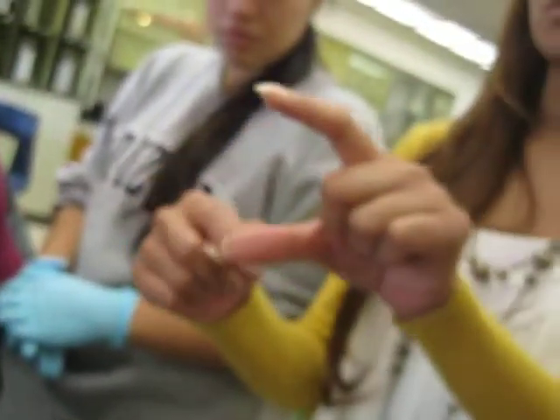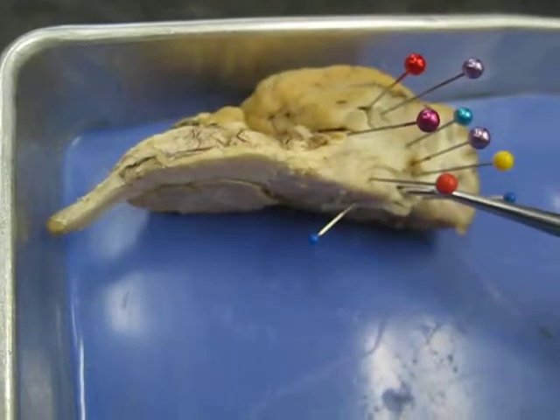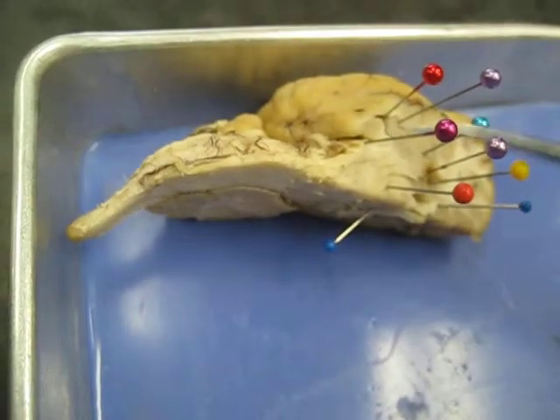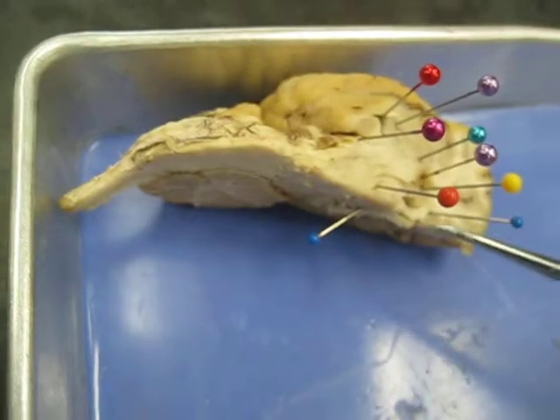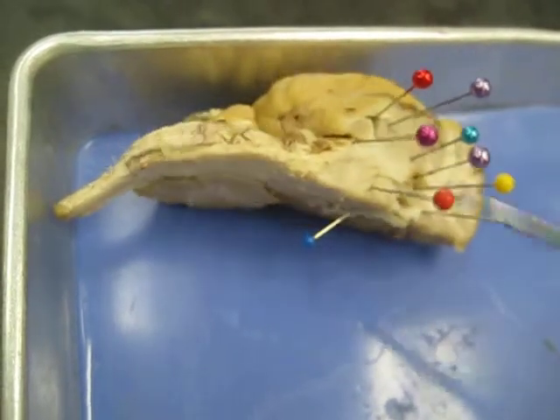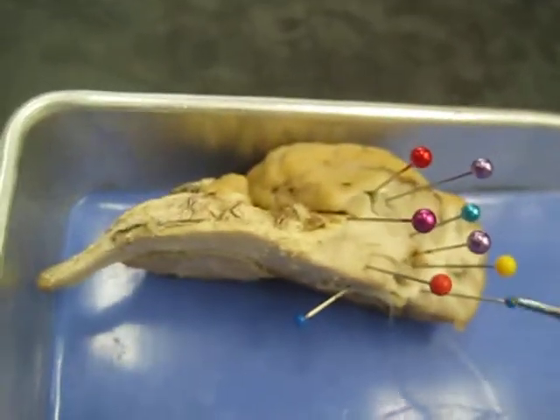So you're going to see 2 holes for your lateral ventricle. So this is your lateral ventricle. I believe it's the frontal horn. And then you have the temporal horn down here. Okay. So it's going to be coming at you like this. Oh, I see. Okay, so that's your frontal horn and your temporal horn. Those spaces are the lateral ventricles.